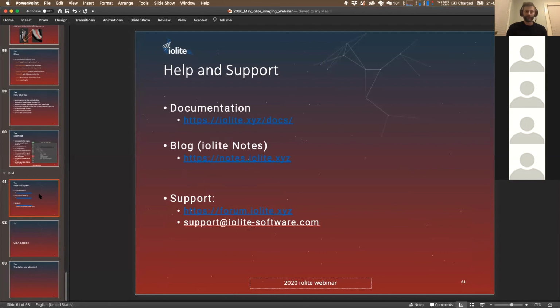We're expanding the Python API as well, so that you can do even more with this, and it becomes clearer, because as we've always said with iolite 4 and with all of iolite, it shouldn't be about what we think is how you should do things. You should have the freedom to do whatever you want, just using iolite as a platform. So that's one of our guiding principles. Hopefully this gives you some ideas for some of the things that you can do.